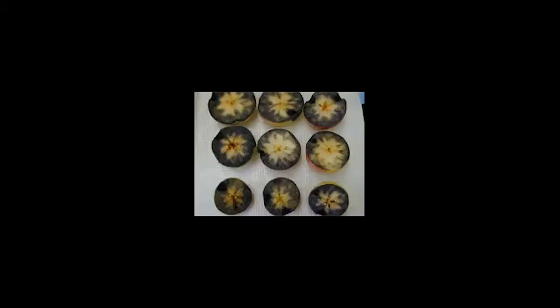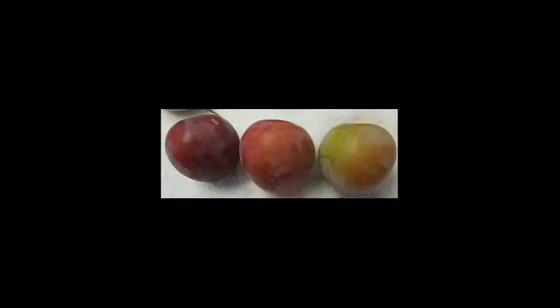Similarly, starch iodine test, that is a chemical test, is performed for most green varieties in which color change is not a good index of maturity. Starch iodine test is performed to check whether the fruit is mature or not. Talking about plum, in most plum cultivars, change in color is a good index of maturity.